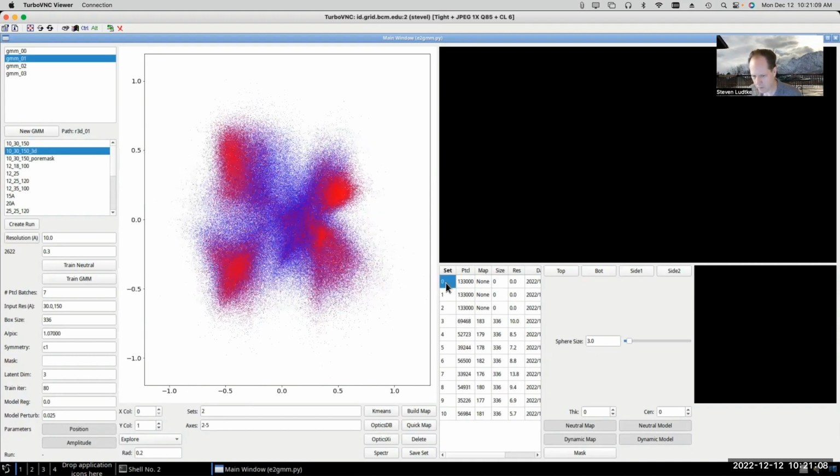So here, if we look at 1 set, 2 set, 3 set, we can actually see there's more substantial correlations between the distributions in the latent space and the 3 different populations of particles when we don't use the mask. So basically what that's saying is when we just look at the pore region, the changes are much more subtle when we relate it back to the different biochemical states, but there are still some very interesting subclasses going on when we look at the actual data.